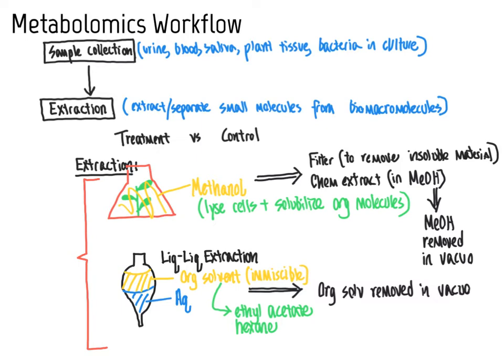So at the stage of the extraction, a limitation here is that not all organic molecules will be extracted into the organic solvent. For example, if we had a relatively polar organic molecule, when we did the liquid-to-liquid extraction, that could very well end up in the aqueous layer there, and that would then be missed downstream.